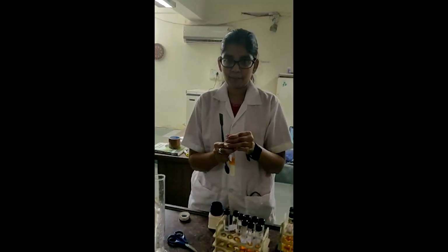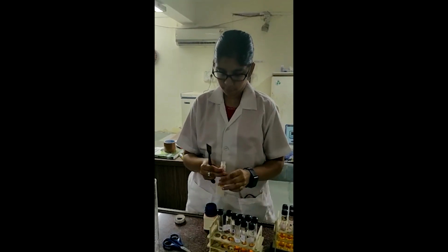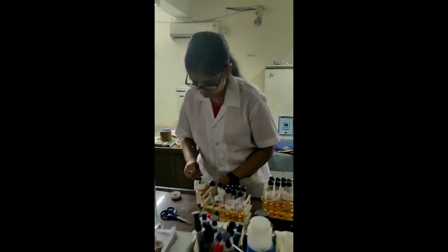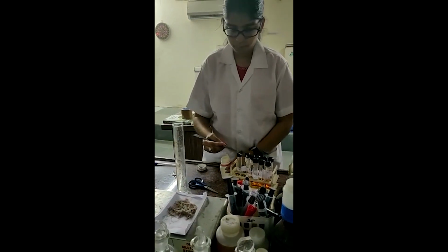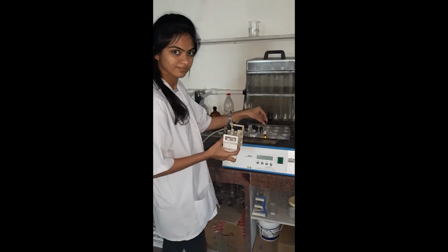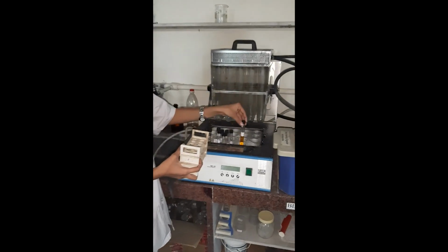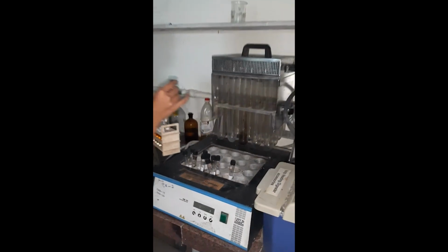After this, we will add a pinch of mercuric sulfate. And we will close the cap and keep it in the COD digester. We'll keep the tubes in the digester for 2 hours.